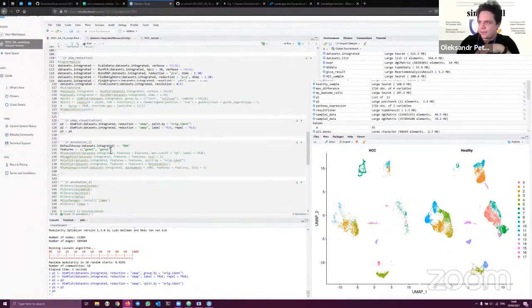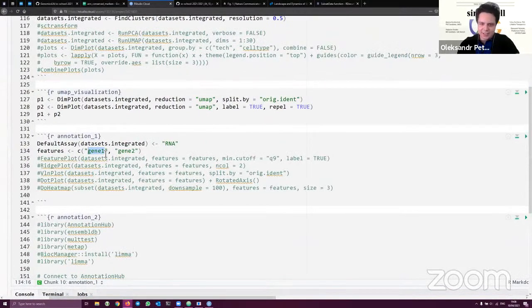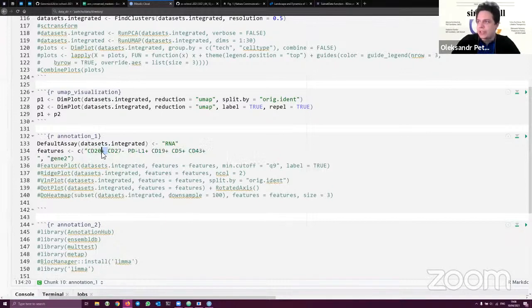Oh, do we have something? Even from the marker genes? Yeah, just name a few please. Oh, okay, thanks. So Tatiana sent me a few markers. I also have a few from Andrea. Now I'm not sure whether the gene names are actually the same, but we'll just try it. And if it doesn't work, it will tell us, okay, so CD27 minus 1. And we'll see if the gene names are different, and it will just show an error.